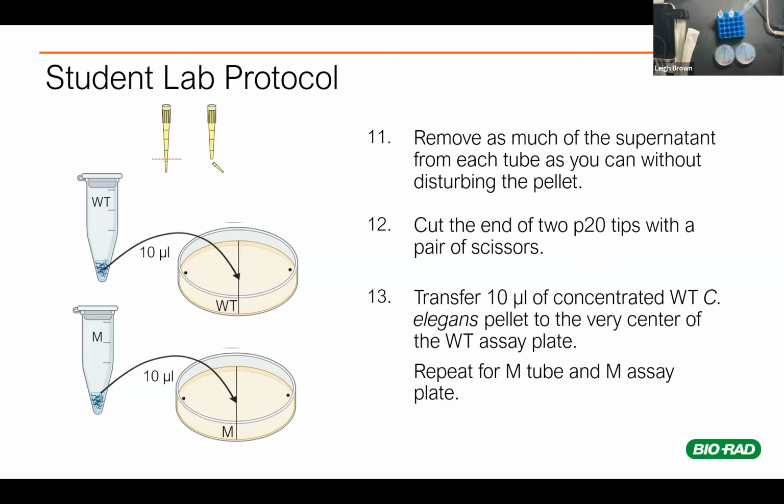And so that's why you've got to cut the pipette tip if you're going to be using pipettes for this. But you also don't necessarily have to use a pipette tip to do this. It's nice because the pipette gives you really tight control over the volume. So you can say, I know I added 10 microliters of both my pellets there.